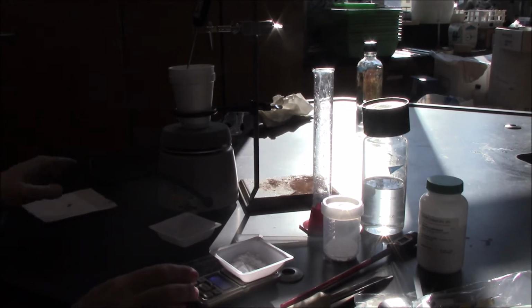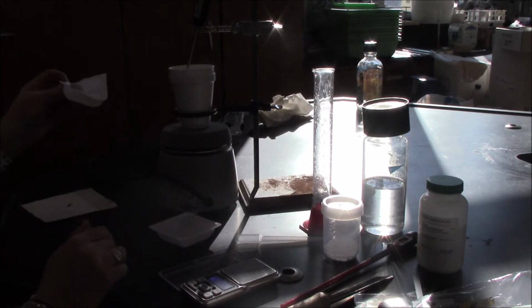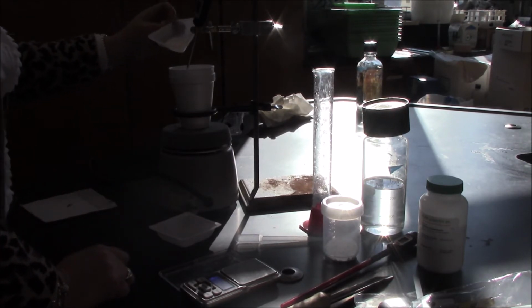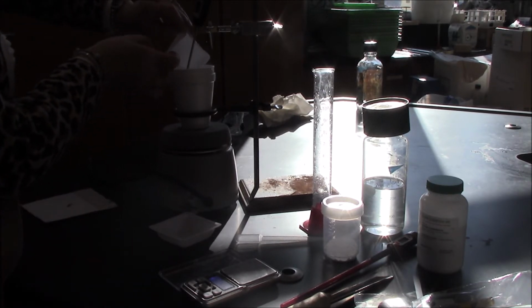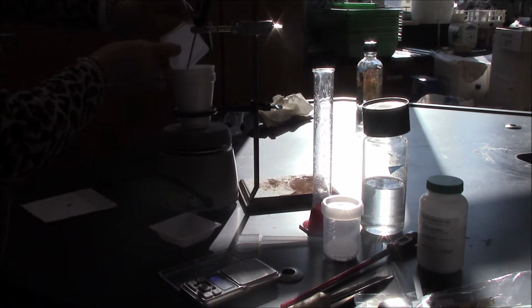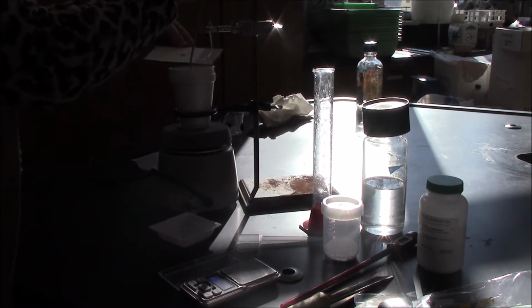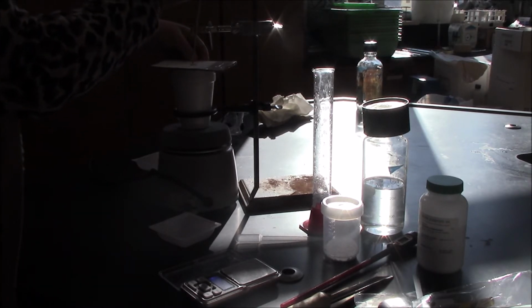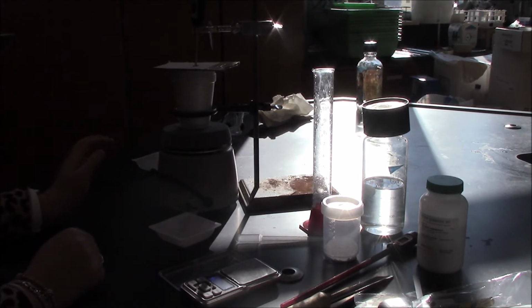And the next step, what I'm going to do is add the magnesium sulfate to the water in my calorimeter, and then add my lid. I'm going to be careful to add it all. Try my best, still not all in there. I'm going to add my lid. And what I'm looking to do here is carefully monitor my thermometer and record the highest temperature it reaches.